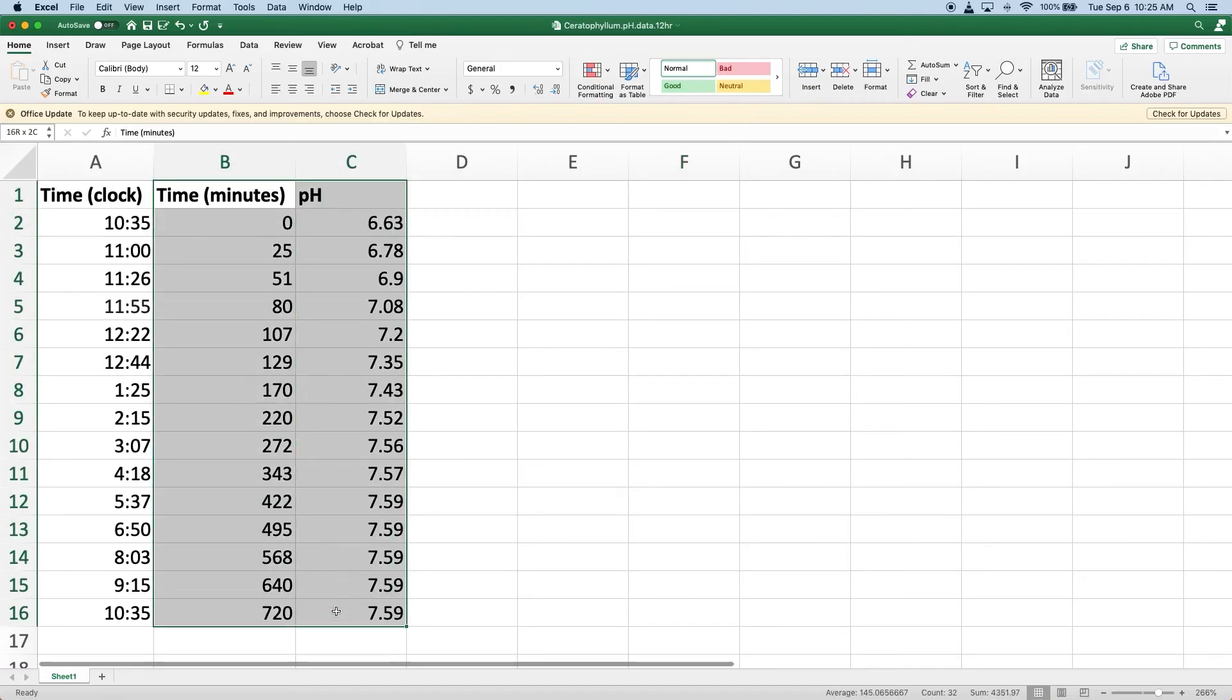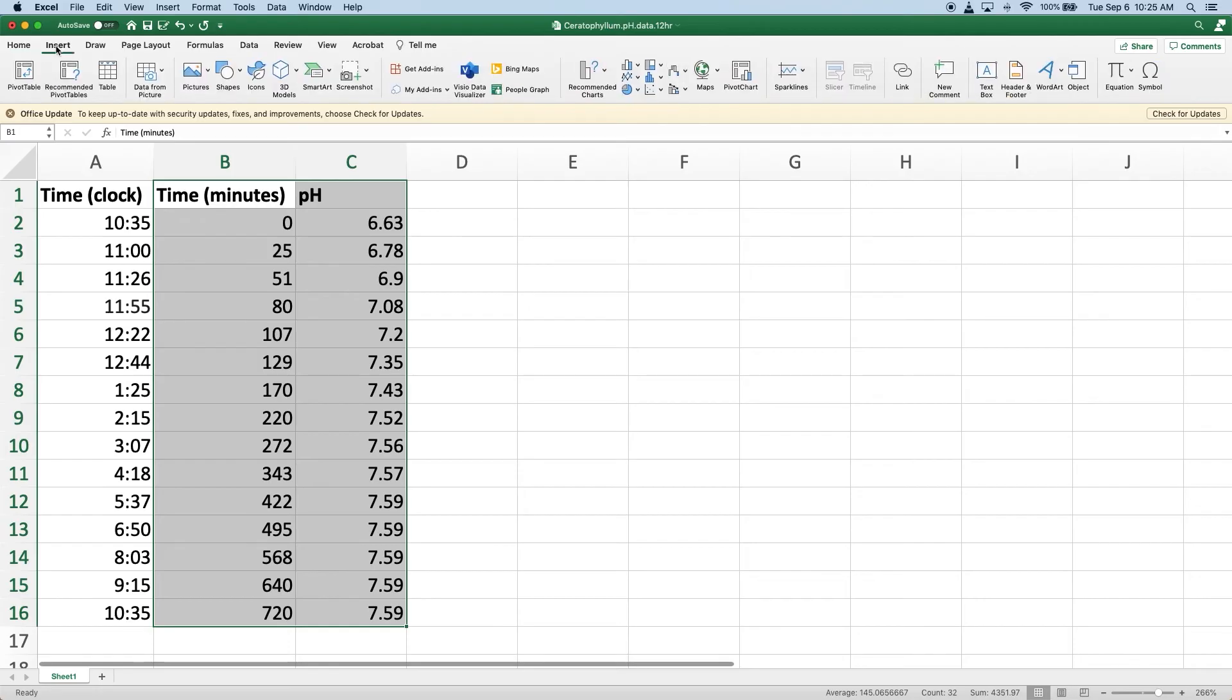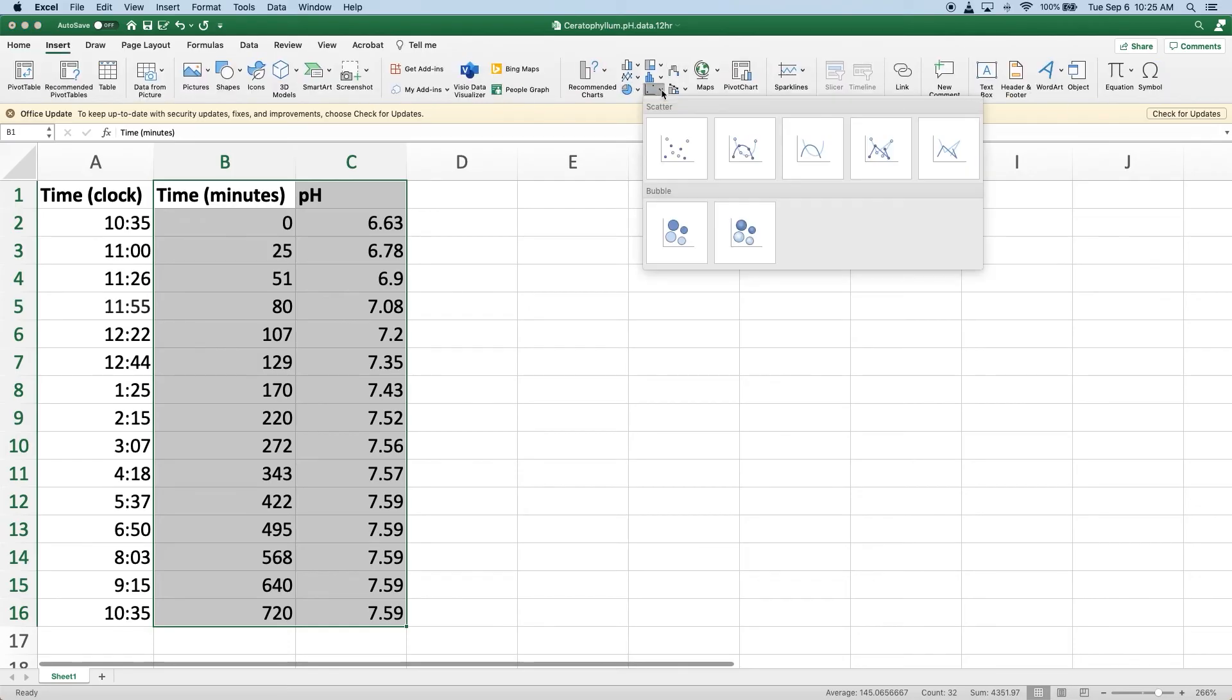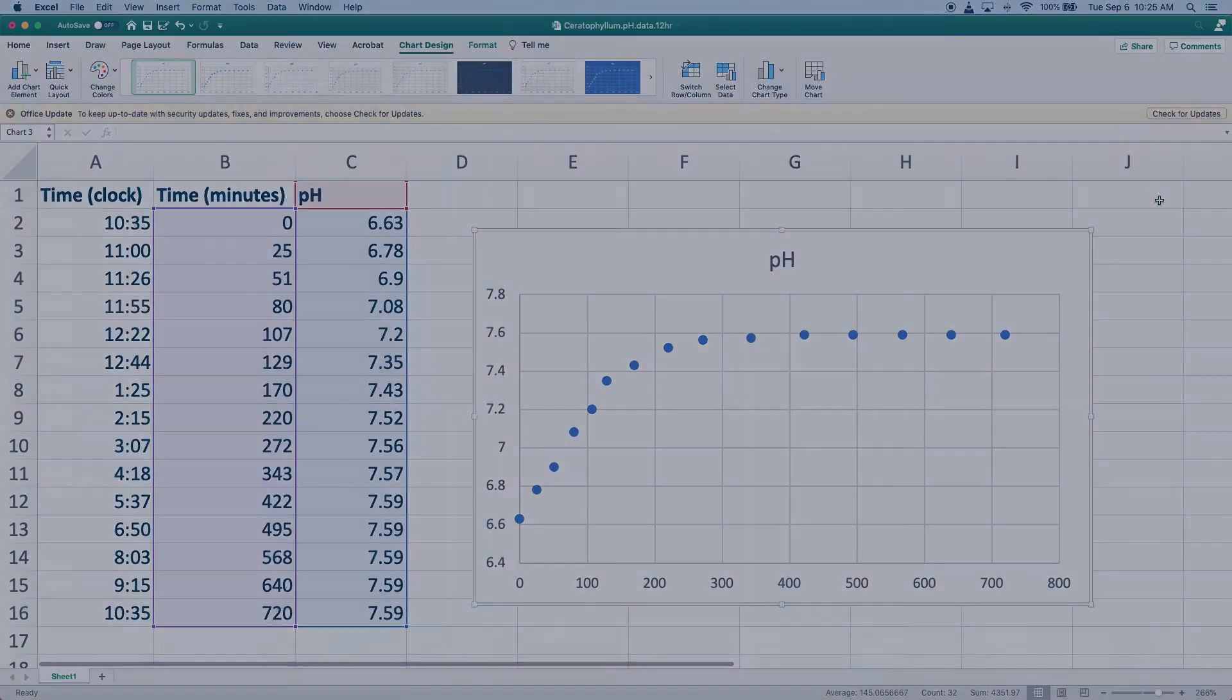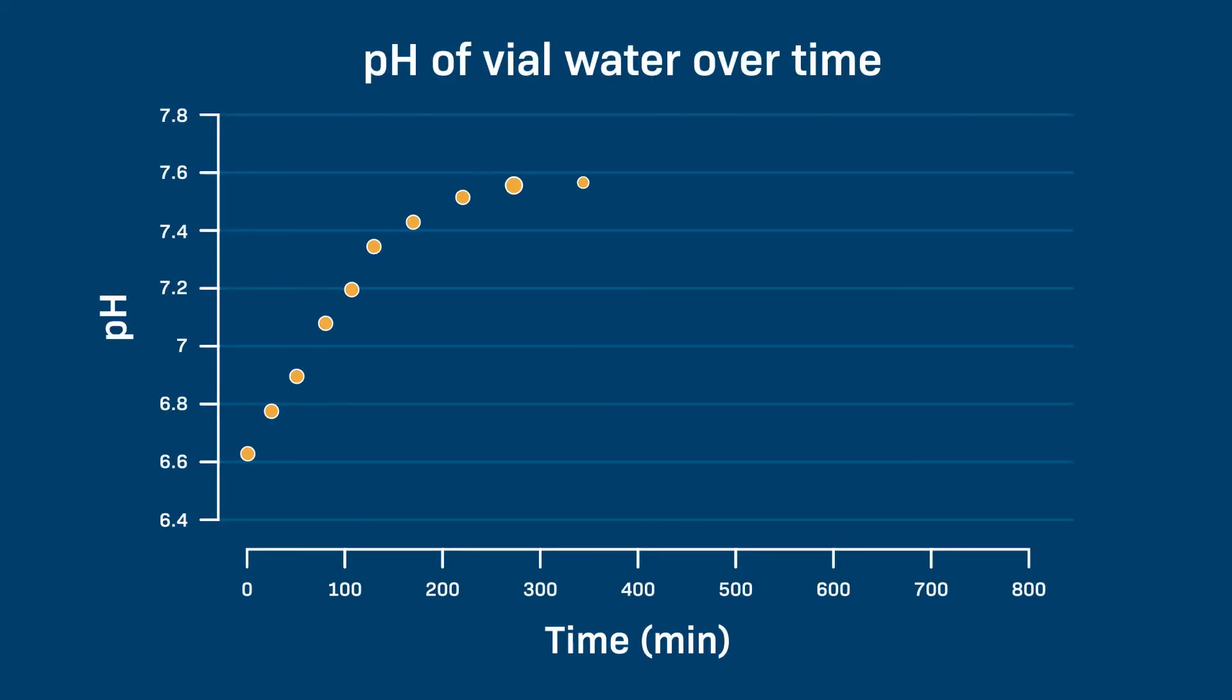So that was our qualitative data. Now let's take a look at our quantitative data, which will tell us exactly how much the pH changed, and what the pattern of that pH change was. Here are all of the pH measurements I took of the plant light vial. Using Excel, I'm going to plot time on the x-axis and pH on the y-axis. The starting pH was 6.63 and the final pH was 7.59, but the change didn't happen linearly.